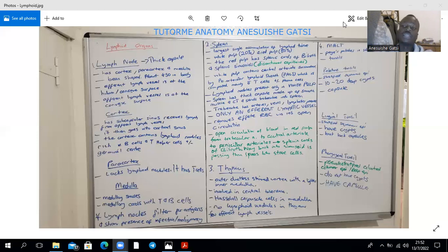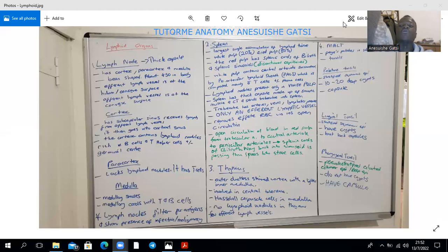In the medulla, there's negative selection, where we remove those that are able to bind self proteins. The medulla of the thymus is characterized by having Hassall's corpuscles. You don't find lymphoid nodules within the thymus, and there are no afferent lymphatic vessels entering the thymus, with few efferent lymph vessels.